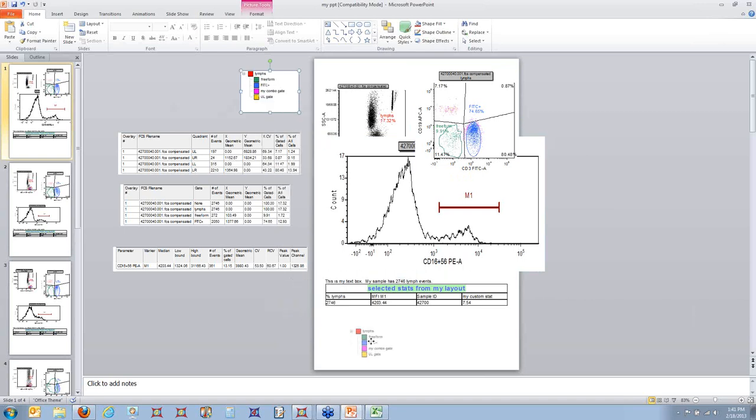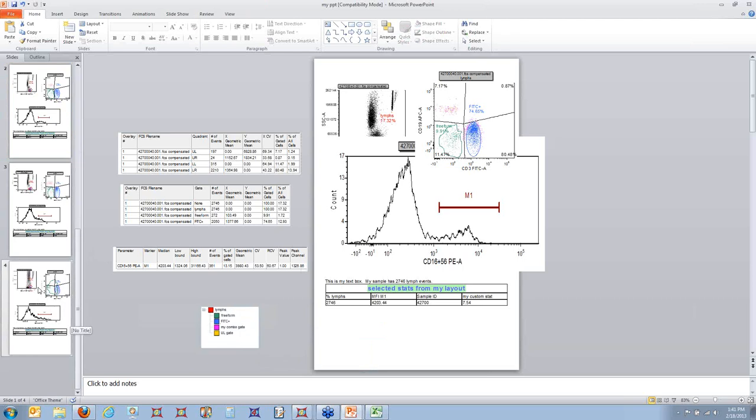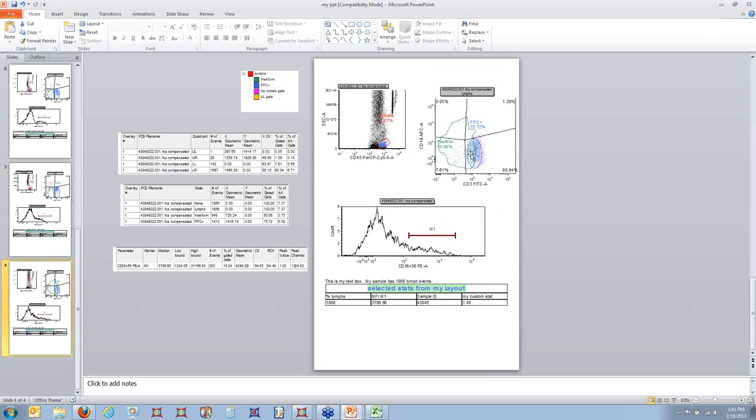So it's nice that you can move them to the page proper if you want to include them in the slideshow presentation, or you can leave them on the background and just use them as notes for the presenter. And if I come down to one of those other samples, this is the last sample where I adjusted that freeform gate to be huge.